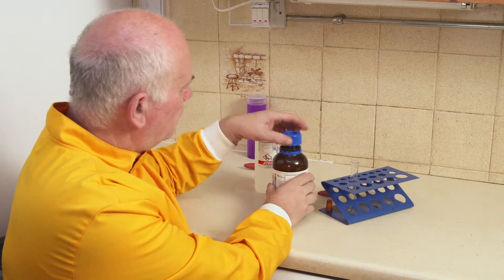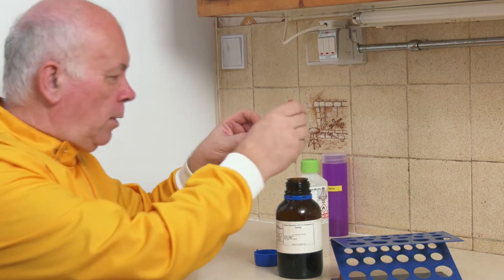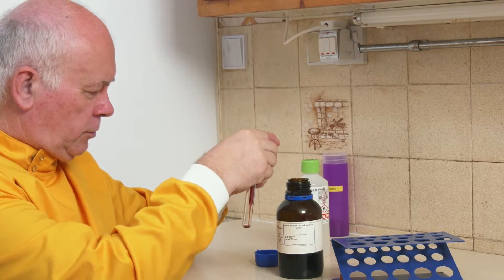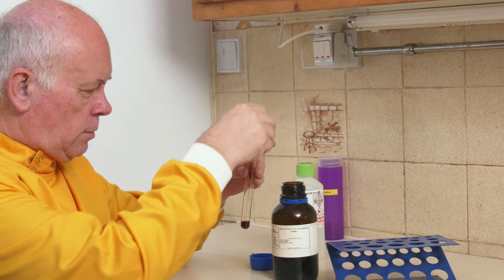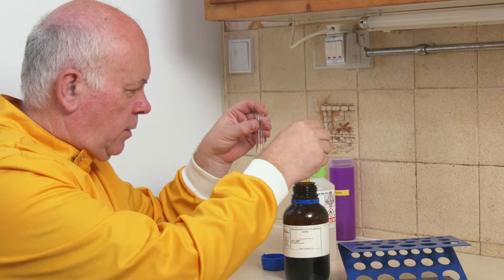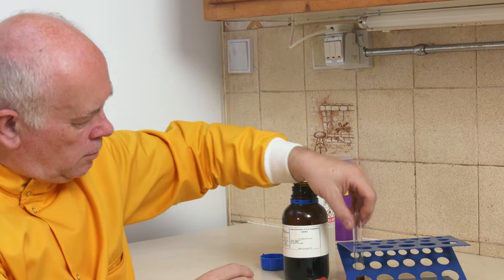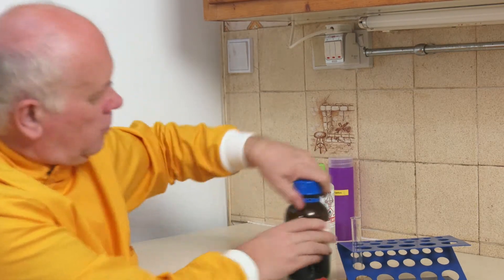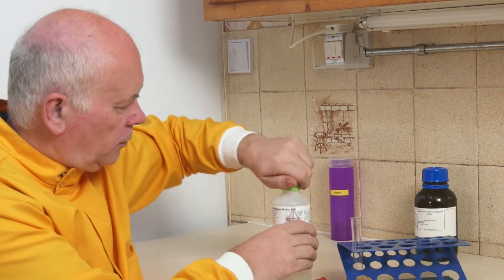This iodine solution is what you're familiar with when you're doing the iodine test experiments. I'm going to take a little bit of iodine solution — that's probably enough — and I'm then going to use some cyclohexane on top of this.